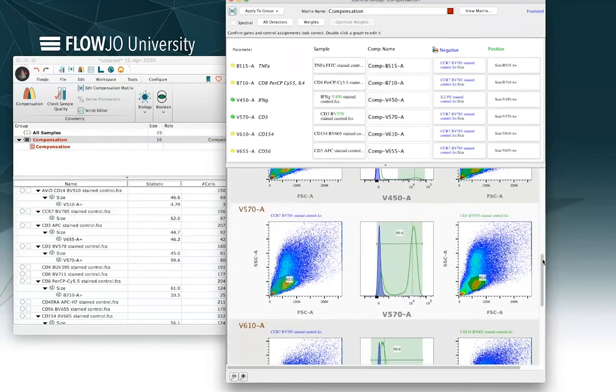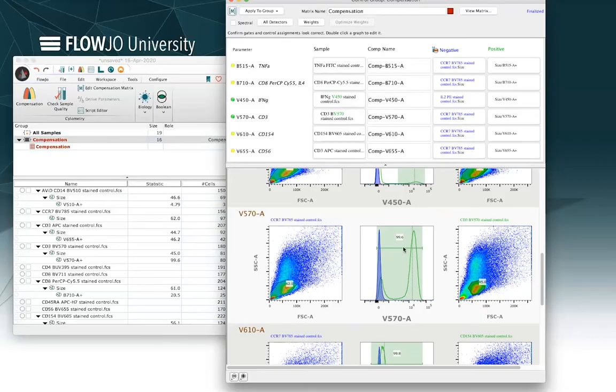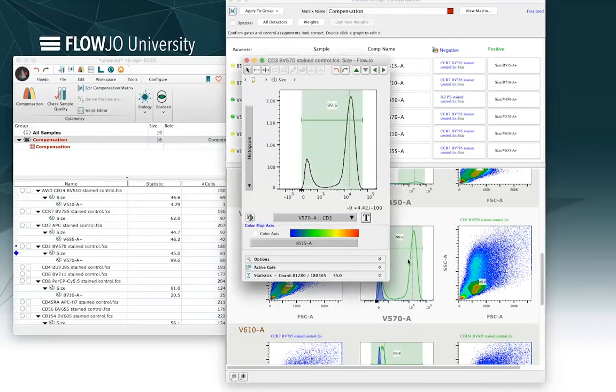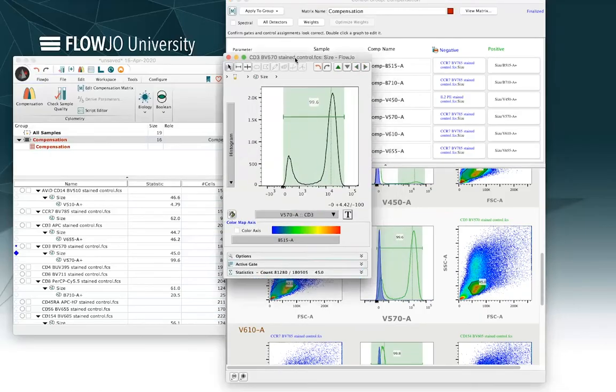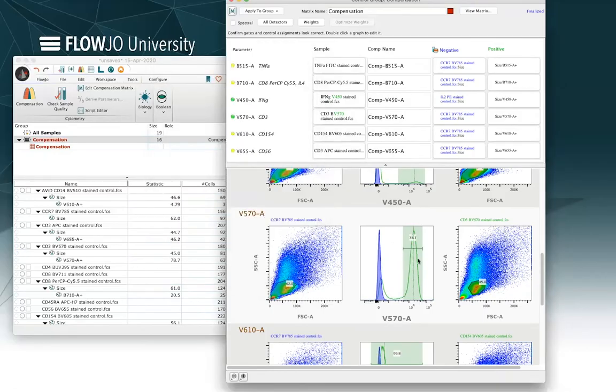So I'm going to keep scrolling through my list and I notice a problem spot here. It looks like we're incorrectly assigning a peak to the positive for V570. The positive peak is always shown in green and the negative is shown in blue. So let's dig in here just by double clicking on the graph. I can open up the graph window in FlowJo and I can make adjustments to the gate there. Okay, that looks a little bit more like my positive peak and now that's adjusted and refreshed the compensation calculation.